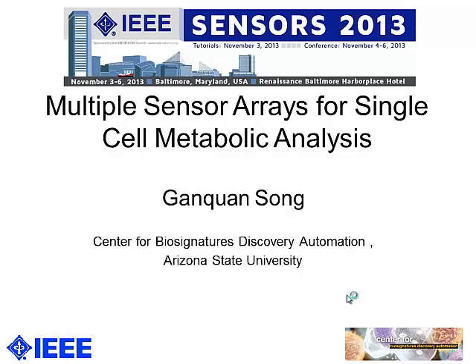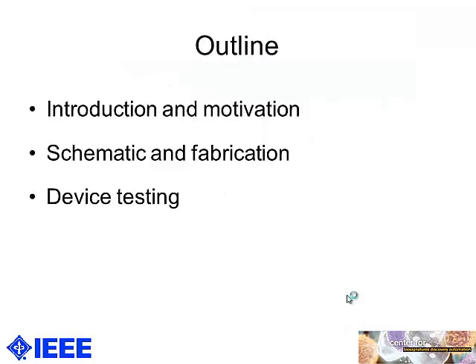It's a great honor to be here to present today's topic, the multiple sensor arrays for the single cell metabolic analysis. I will talk about 3 parts today. The first part is the background and the motivation. The next is the process flows of the fabrication. The last is the characterization of the device.